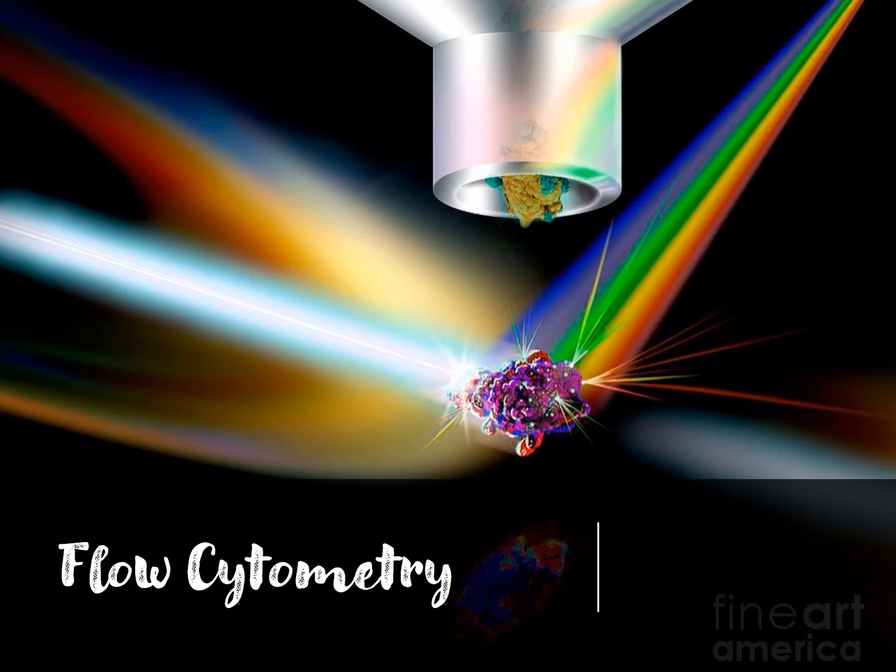We also talked about the other applications, immunohistochemistry and immunocytochemistry. Those IHC and ICC are used for visualizing tissue sections and cells respectively. In flow cytometry, the detection works more at the cellular level. So as we go through this lecture, it will become clearer.